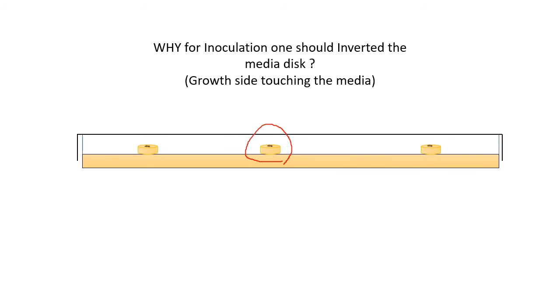Why must you invert the disc? The growth should touch the media. If you keep the disc without inverting, the fungal colony is only in contact with that particular agar block. It will grow only until the nutrients from that block are exhausted. Once nutrients are lost, the colony will not grow further. To avoid that, invert the disc so the growth touches the new media surface, giving access to fresh nutrients.